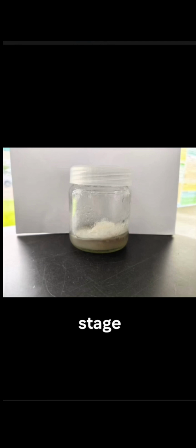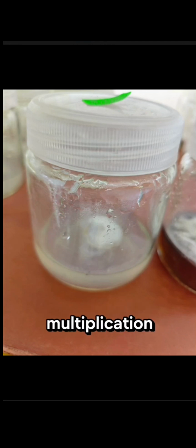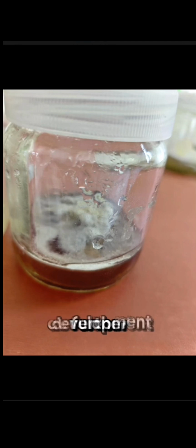Unfortunately, at the rooting stage, we were not able to achieve it because fungal contamination was observed during the multiplication stage. The contamination spread in the agar medium and affected the explant, making further development impossible.